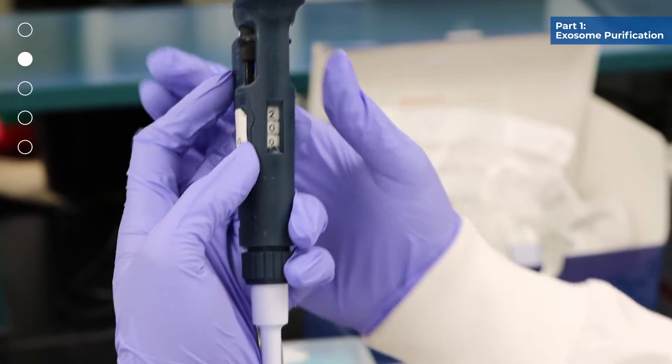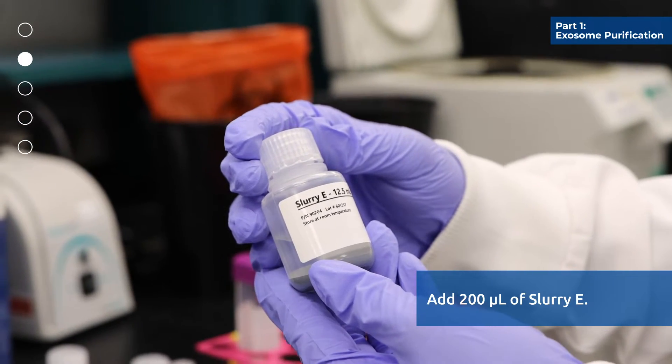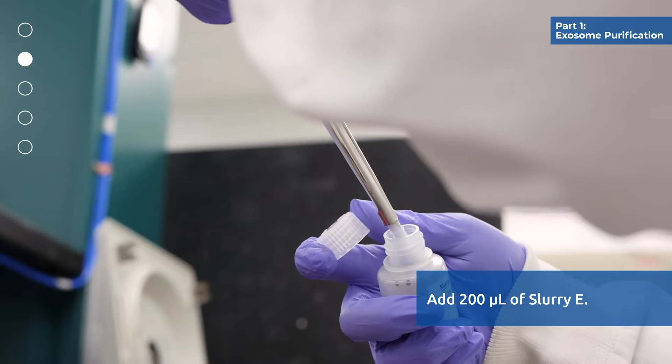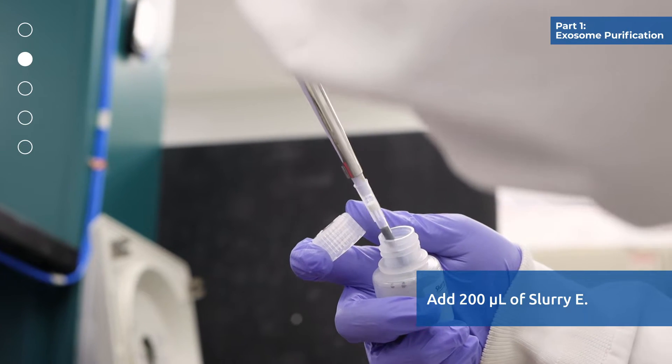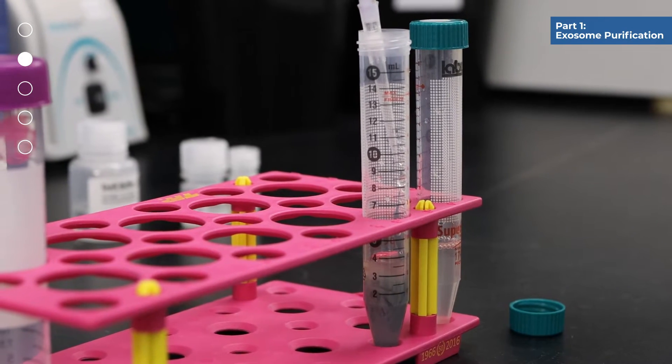To the mixture from step 1, add 200 microliters of slurry E. Note that you should mix slurry E well prior to use. For optimal performance, ensure that resin is completely re-suspended.